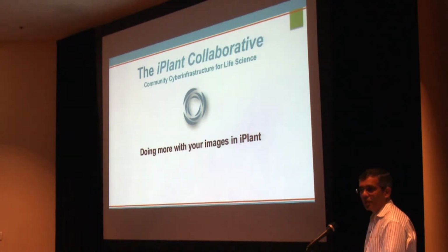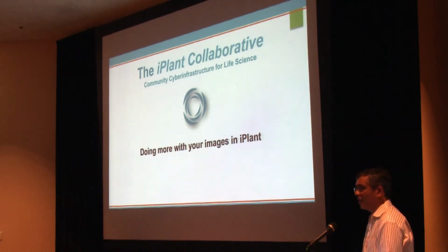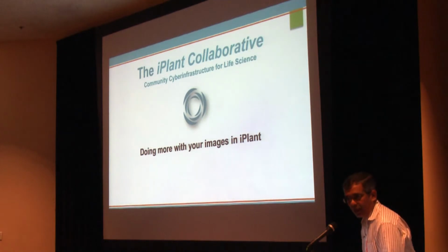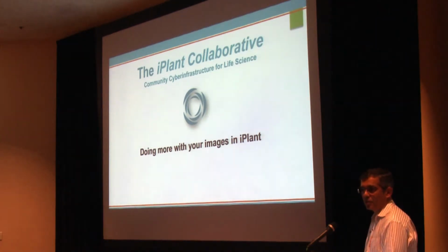And you keep hearing phenotyping, and at the end of the day, imaging is at the center of phenotyping. And most people are trying to figure out how they are going to handle robots spewing out images at them. And so iPlant has also put effort into not just managing sequencing data, but managing imaging data.